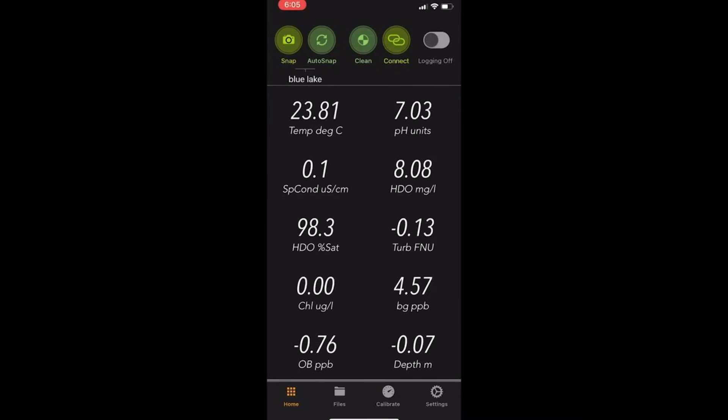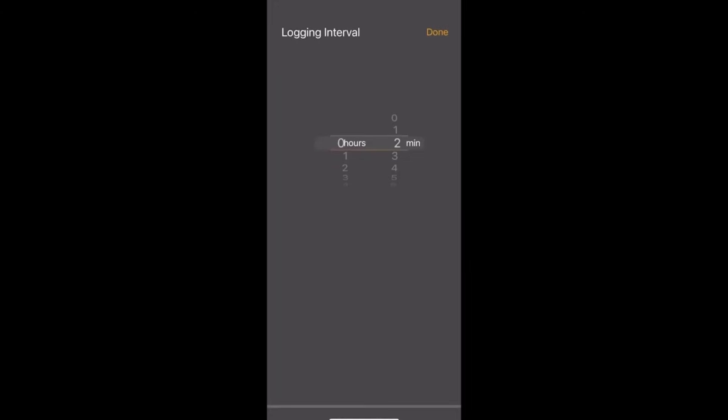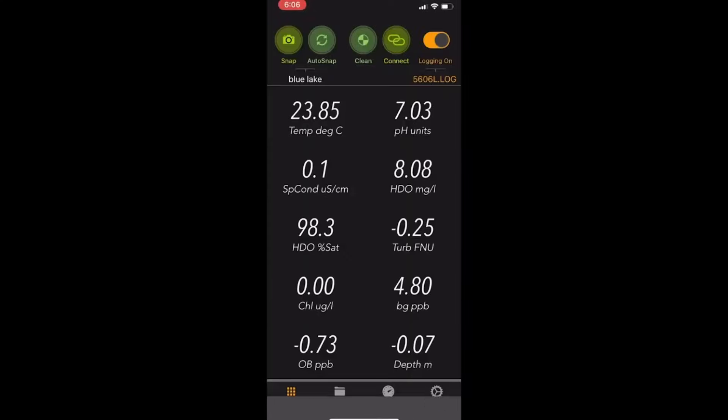Then we'll talk about logging on and off. You can just tap on logging to turn it on and it will immediately display a logging interval, which you need to set. If we wanted to set logging interval for five minutes, then click done.